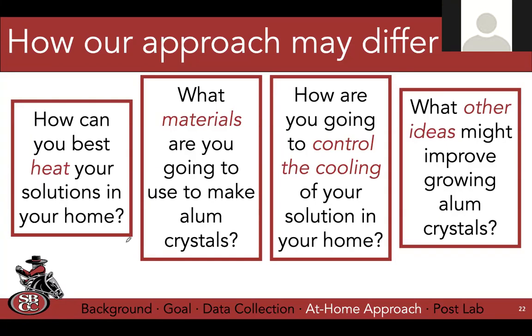But I had a question. If I had enough alum, because I bought like a pretty big bag on Amazon by accident. And could I do it all in a single pot if I dissolved enough in a solution? And say I use the wooden stick technique, put the seed crystal on floss or whatever, and then just keep it in that single pot. And when it cools down, add more alum, then heat it back up. That type of deal. Yeah, and so I talked a little bit about saving the solutions afterwards because there's still alum in those solutions. And so you can reheat that and just put more alum in until you reach that solubility point and keep going.